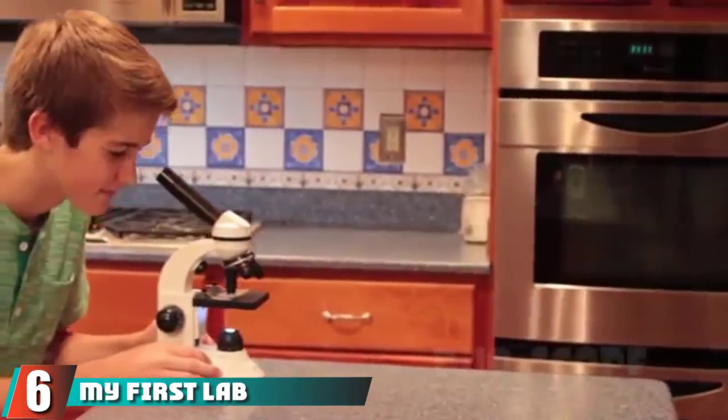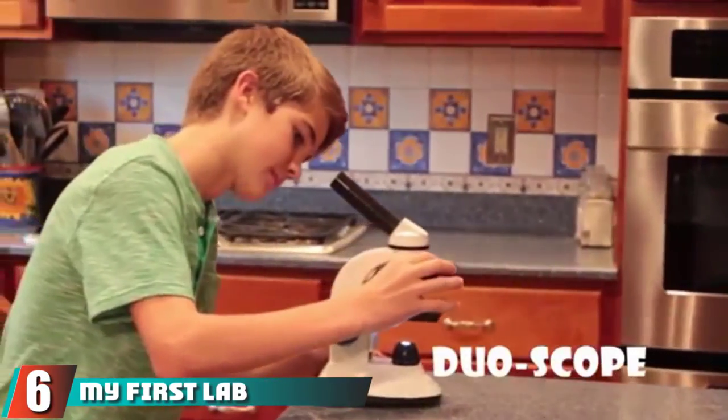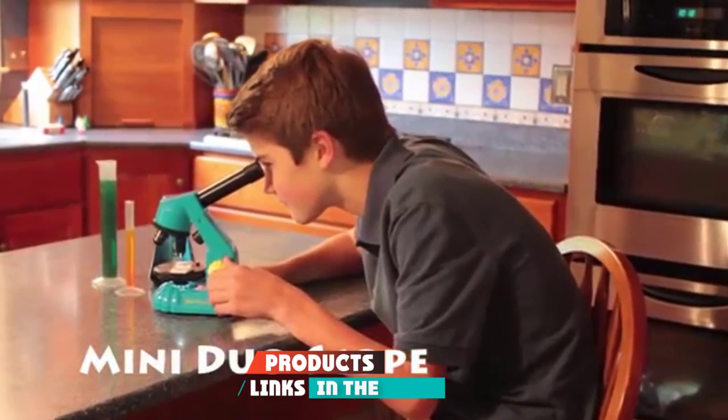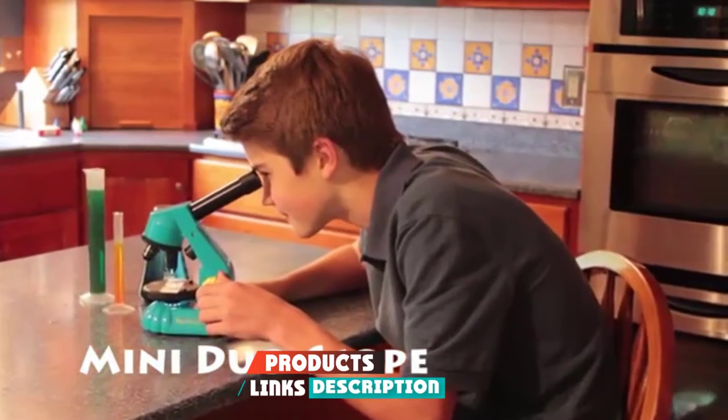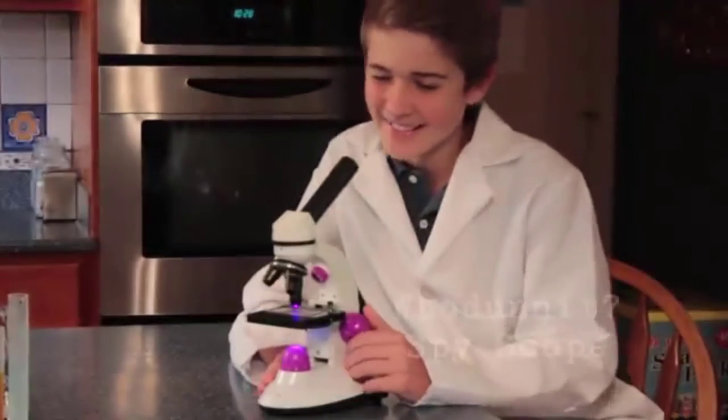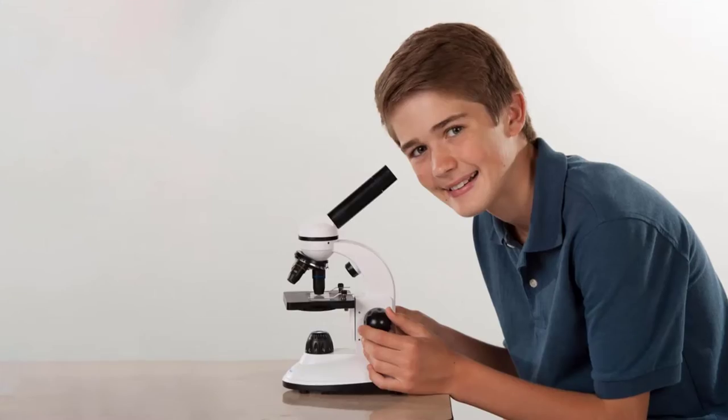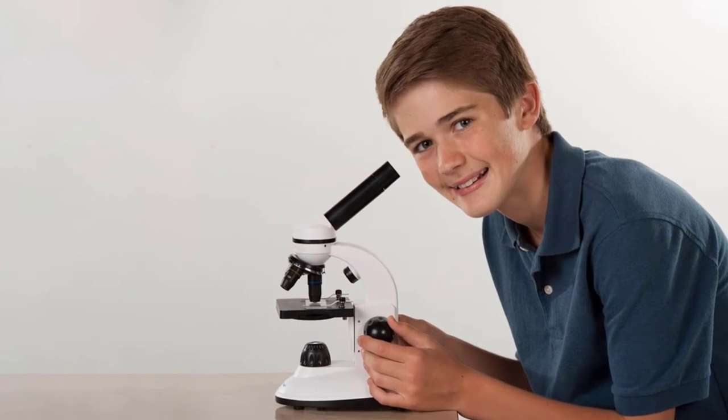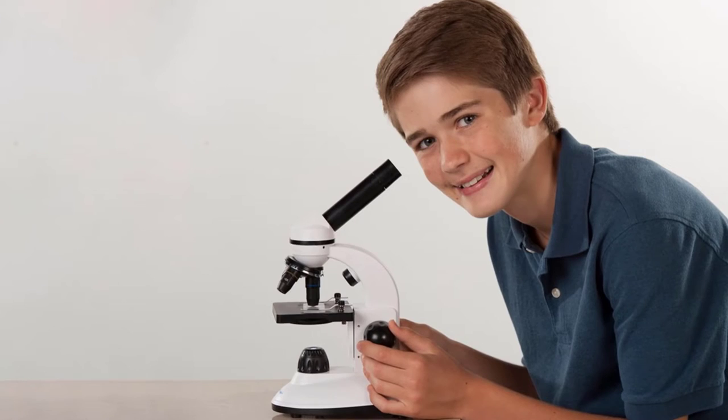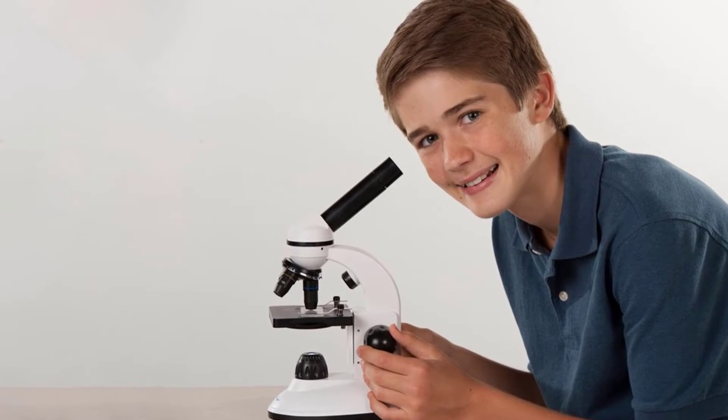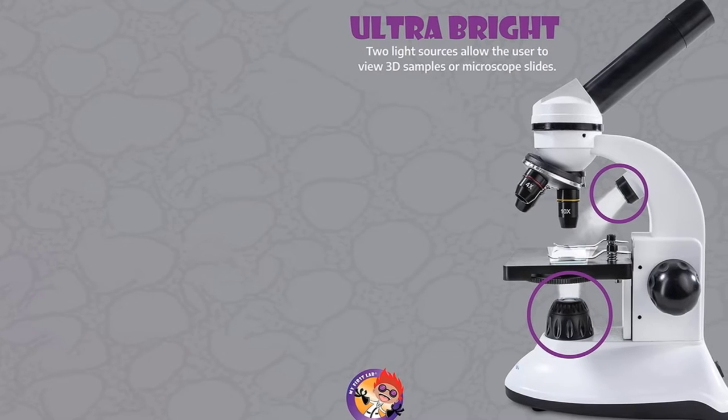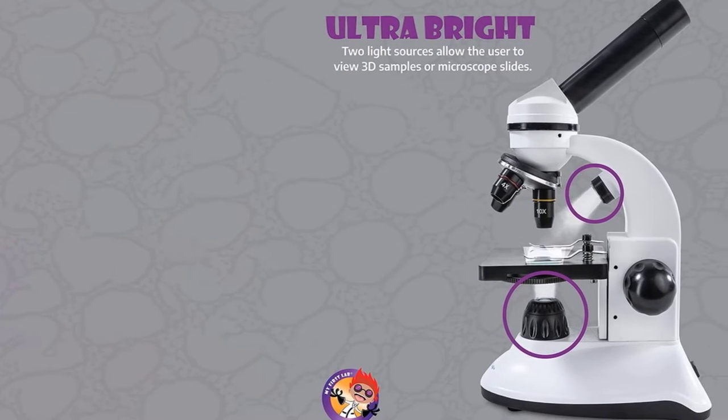The number six position is dominated by My First Lab Duo Scope Microscope. Some suggest that this is one of the best microscopes for kids, thanks to its usability. It is possible that middle schoolers may still use this device all the way through college. My First Labs' rendition received a positive microscope review for its professional scientific feel, as it can act as both a compound or stereo microscope, which makes it a versatile choice. Build-wise, it is made of plastic, which might not be the best in durability.